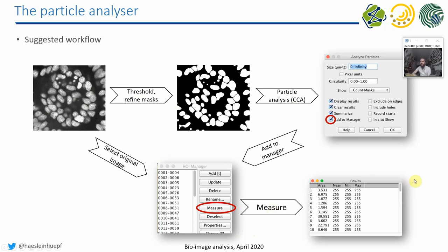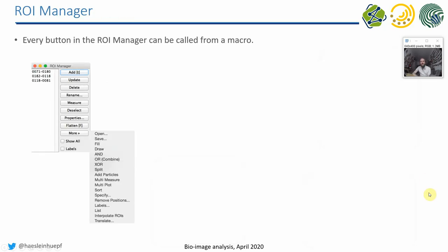And we can actually use the same strategy as we have the ROIs here in our ROI manager. We can use the same strategy to also visualize the ROI. So instead of just putting something in the results table, we will also visualize ROIs.